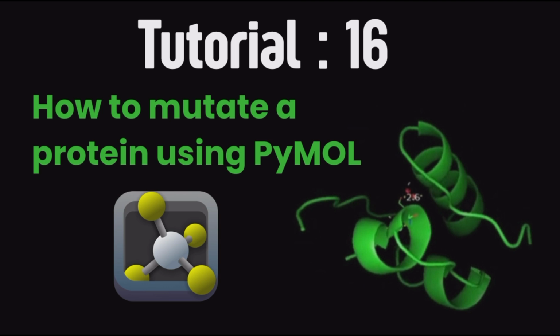There are several other utilities, okay, but in this tutorial I am going to only show you how to induce a mutation, and for this I am going to use PyMOL, which is a molecular visualization software as well as editing software. So let's see.